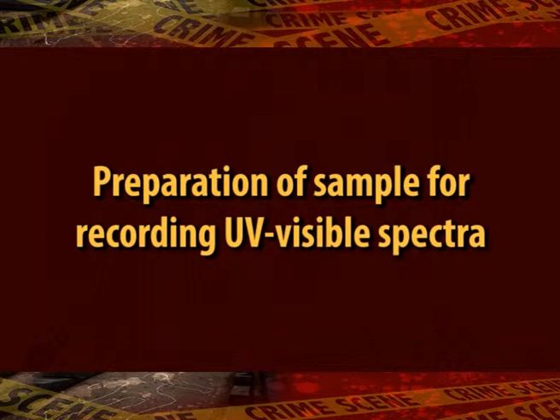For analysis procedure, sampling of substances is required. With this in mind, we will now be studying the preparation of the samples for recording a UV visible spectra. In this section, you will also be acquainted with the various types of spectrophotometers. Preparation of sample for recording UV visible spectra.